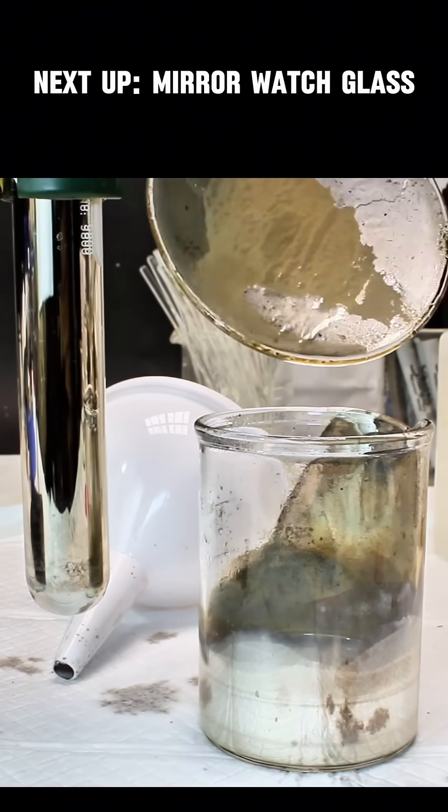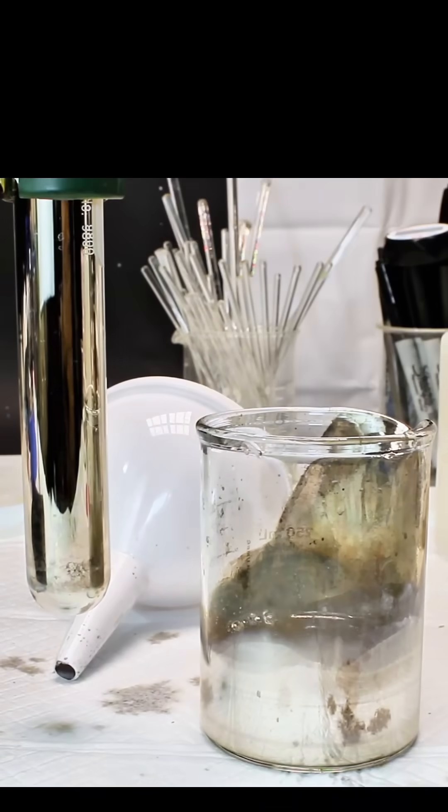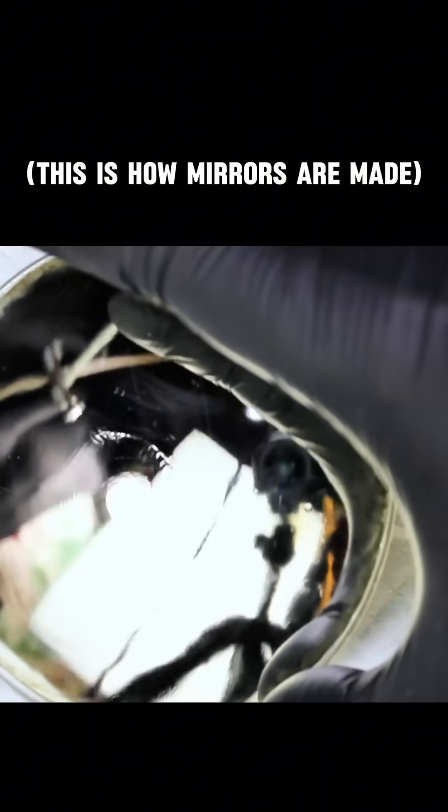Aside from the light bulb you saw at the beginning, I decided to silver plate a few test tubes and a watch glass. The watch glass actually worked pretty well as a functional mirror, and I had a lot of fun messing around with it.